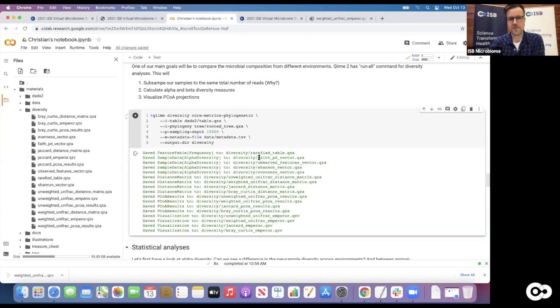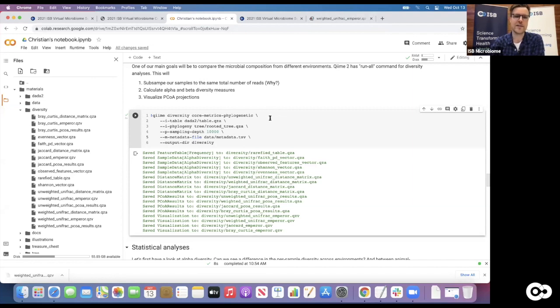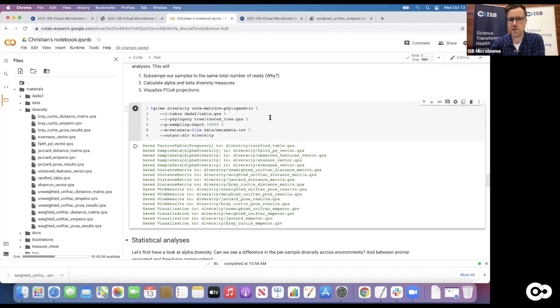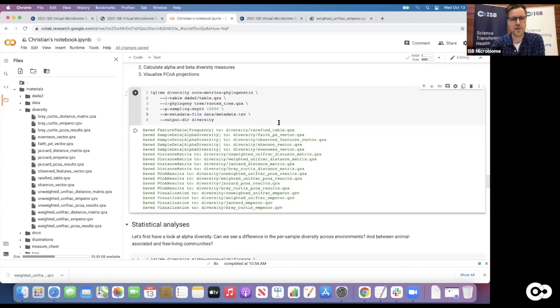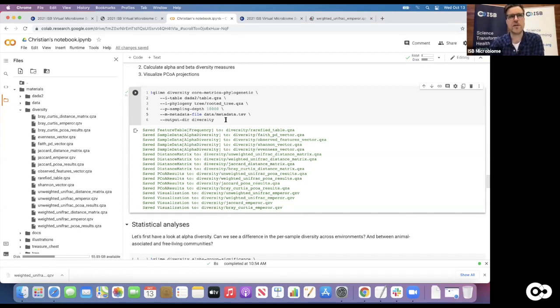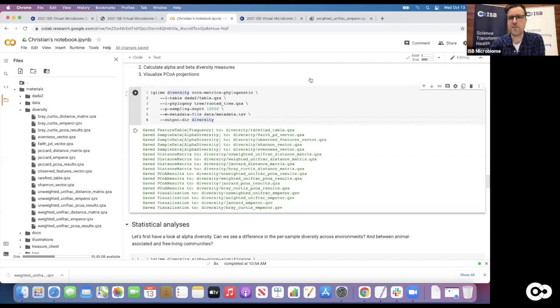We might also be interested in getting some hard numbers on that. Are those separations we see visually actually significant? Can we assign some statistical measure of certainty to them? That brings us to statistical analysis. For alpha diversity it's fairly simple - we can treat it like any covariate, using t-tests or Mann-Whitney U tests for each sample's single value. For beta diversity it's more complicated because we have that weird distance matrix, and we need to figure out how to align that with certain information we have about the environment.